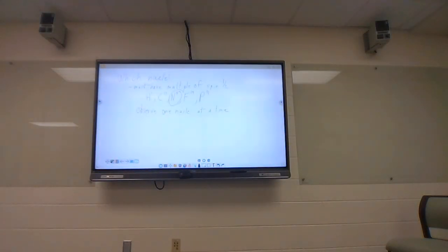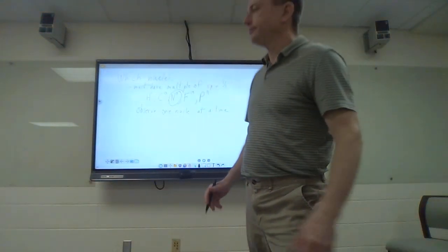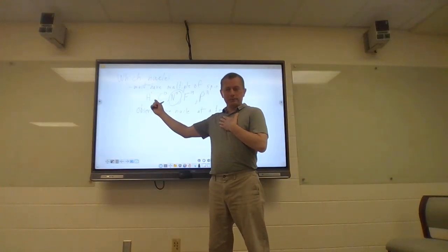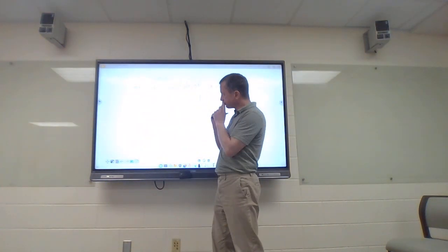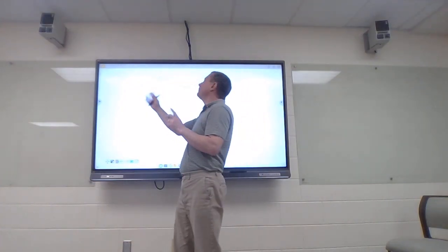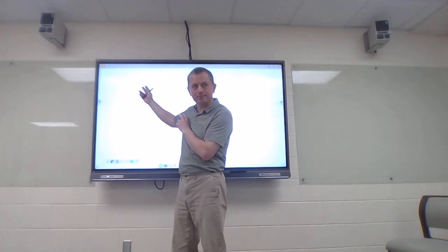Okay. So there are three elements that happen here. Different nuclei can affect my radio wave frequency. Different neighboring nuclei. So a carbon could affect a proton.